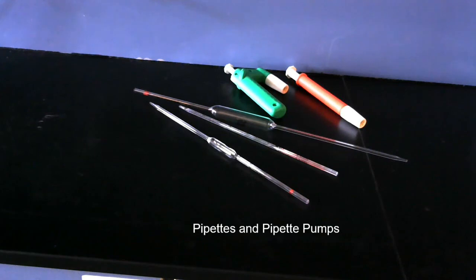Generally those pipettes are good to two decimal places. So if it were a 10 milliliter pipette, it would be 10.00 milliliters is what it's designed to deliver. The graduated one, you're going to have to just go by the markings on the side of the pipette.